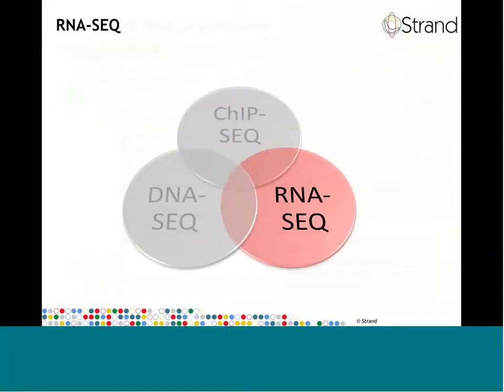So this concludes the section on ChIP-Seq, and we will now move to the next section on transcription analysis with RNA-Seq.